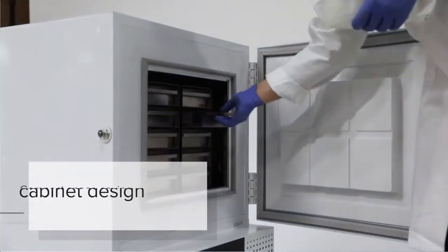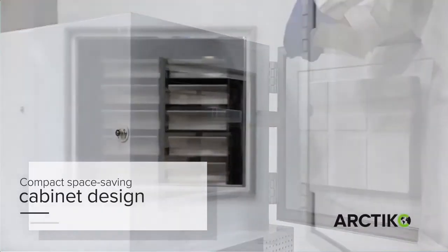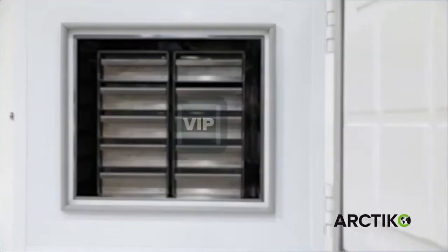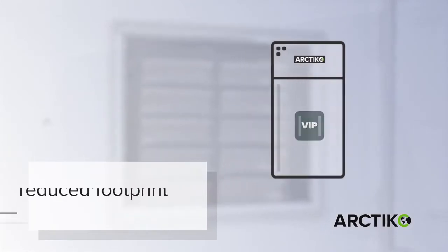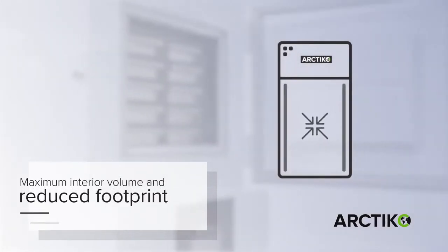Arctico introduces a new compact space-saving cabinet design. Our specially developed vacuum insulated panels are built into the cabinet, which ensures maximum interior volume and a reduced footprint.